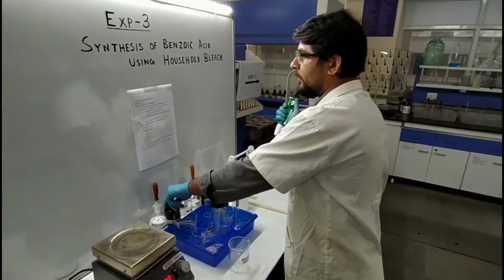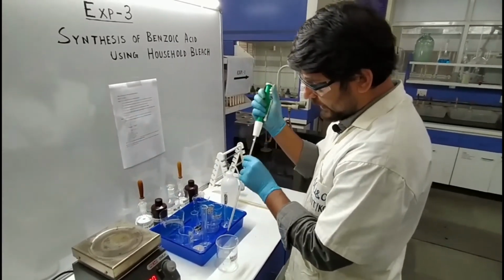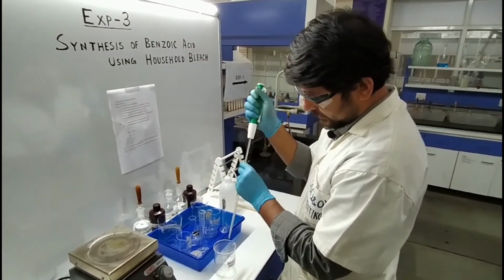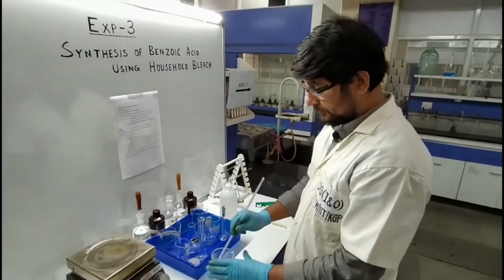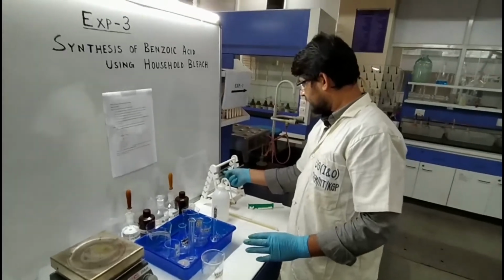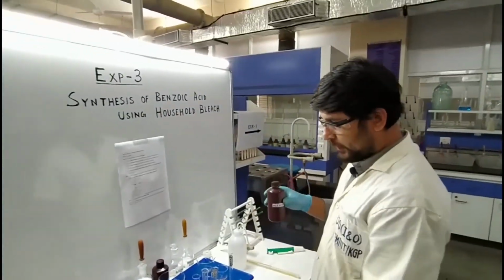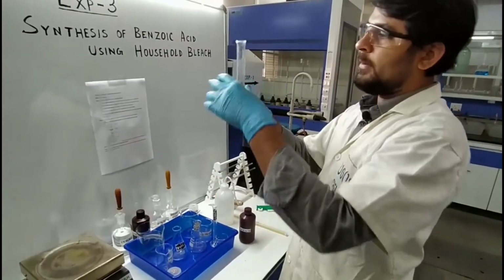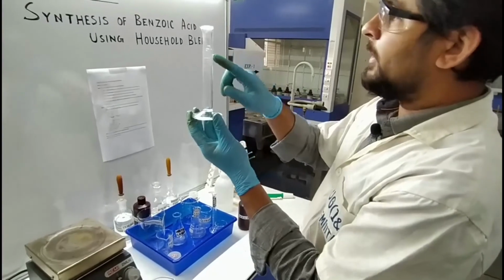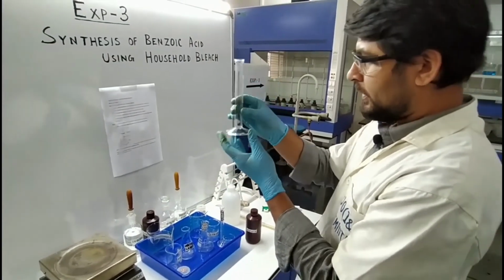Then after that, what do we have to add? 24 ml household bleach. This household bleach is NaOCl. This is the bleach, NaOCl, and you can measure it using this measuring cylinder, which can measure 25 ml. How much is required? 24 ml. So we have to take up to this.